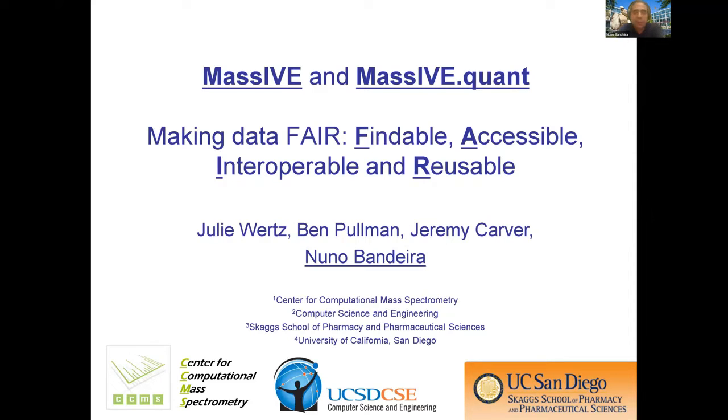So I'm going to give just a brief overview of how we see this at MassIVE, where we really focus on developing methods and ways to store the data to make it more findable, accessible, interoperable and reusable, or, in other words, just more useful for the community.